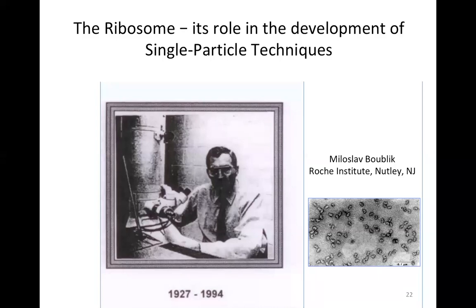And he had these beautiful, beautiful images of ribosomes. These were 40S subunits, small subunits of a eukaryotic ribosome, in fact, of HeLa ribosomes. And so they had very distinct features.